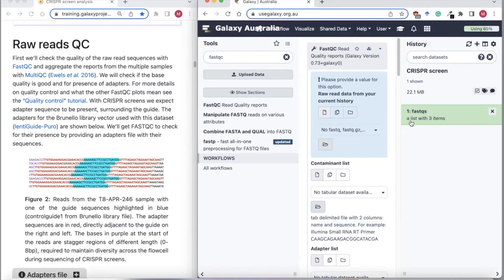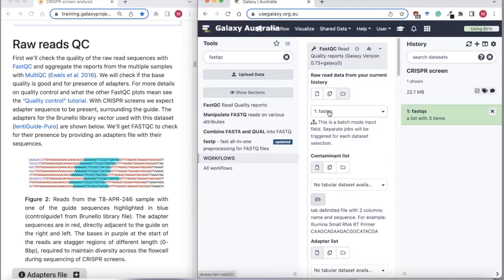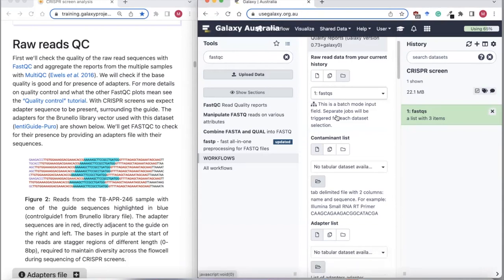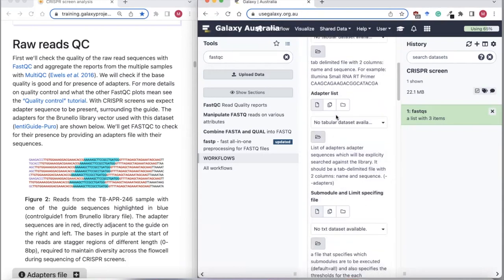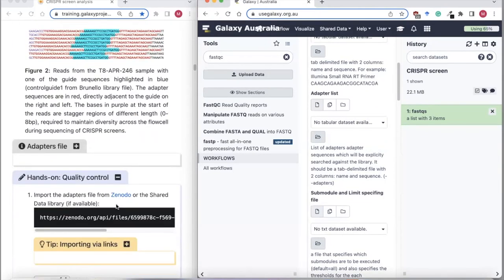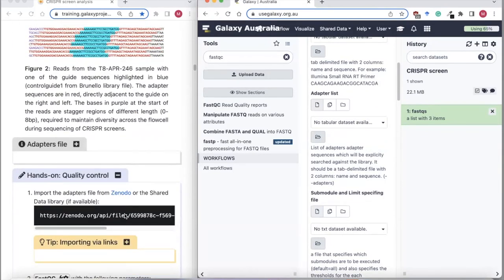Because we are using this collection list, we need to click on the dataset collection icon and then select our collection here — FastQC. We're also going to upload a file containing some adapter sequences, including our CRISPR adapter sequences, so we can have a look at these in the raw data.